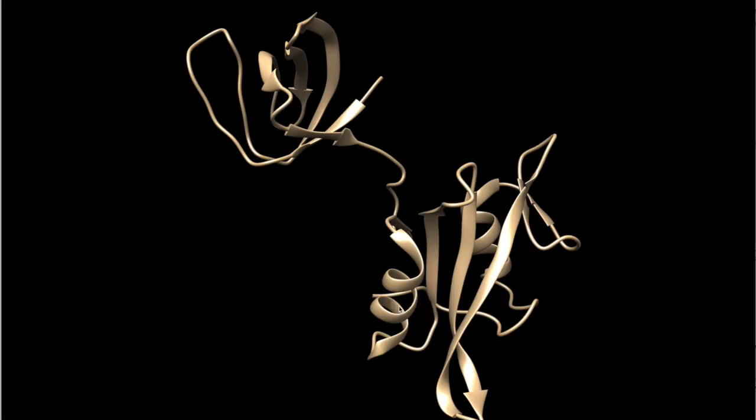So right now, what is happening is that Chimera fetched the model. And it's computing the results. You can see the progress is shown here. 20%. It will take a little bit of time.